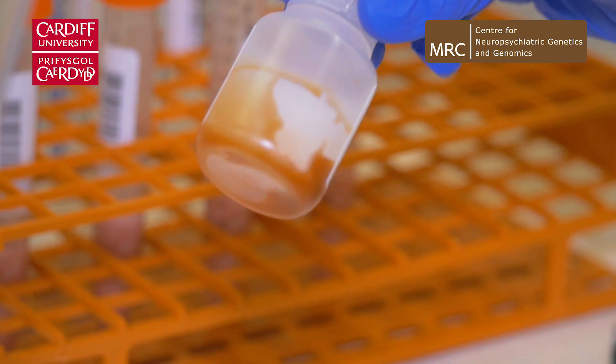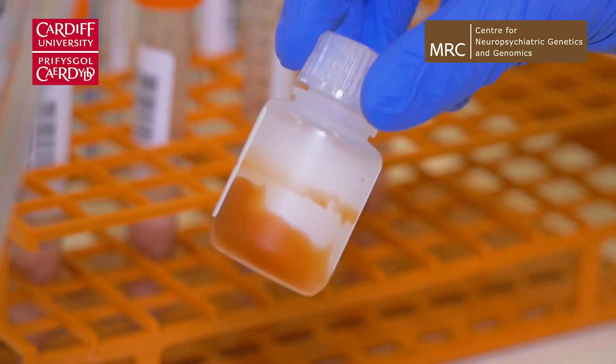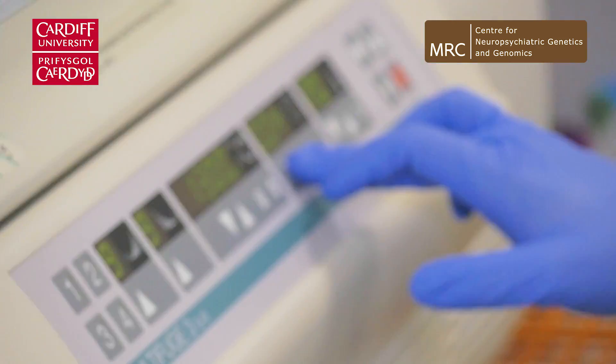Where the water and the chloroform join, it's very difficult to separate those two layers. So to make it more straightforward, we add in a resin and that creates a barrier layer between the two layers. We put that whole mixture into the centrifuge and that spins the samples down and we end up with three distinct layers.